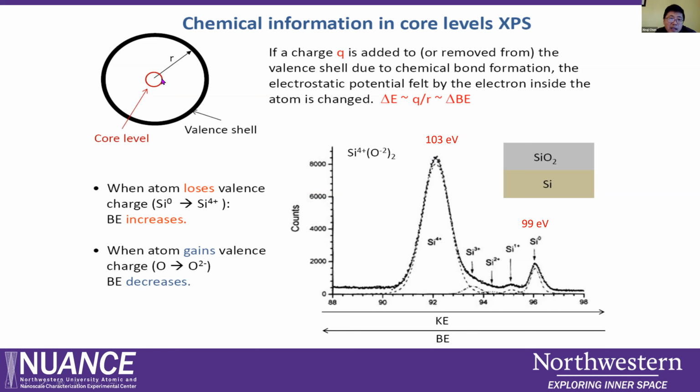So that means the orbital shifts a little bit inside and gets stronger. So basically for 2+, 3+, when losing electrons, you should expect the spectrum to shift to higher binding energy. For elements like oxygen or chlorine, they gain electrons and will shift to the right side. That means the binding energy goes lower. That is the difference, and now you understand why they have this shape.